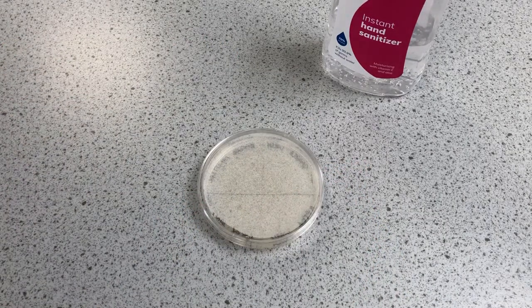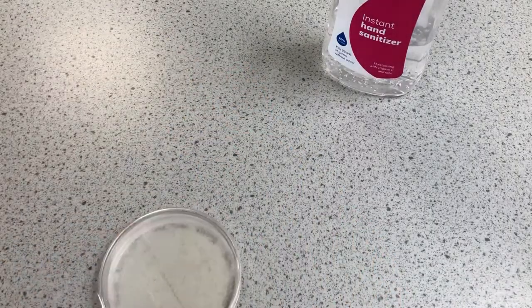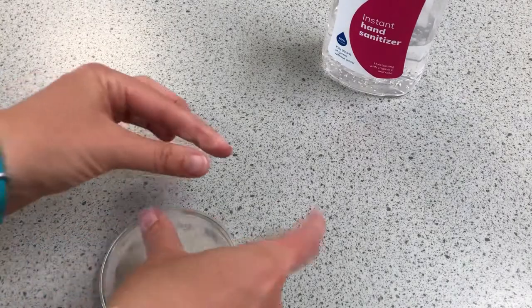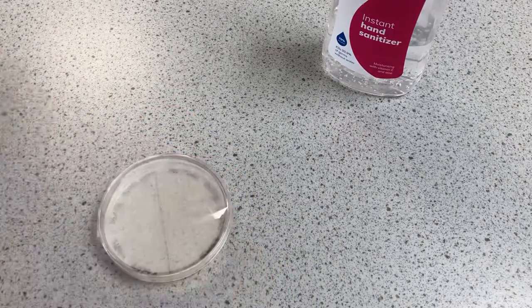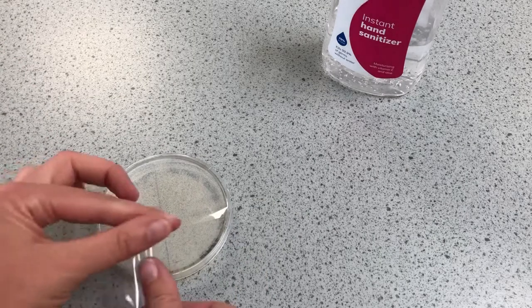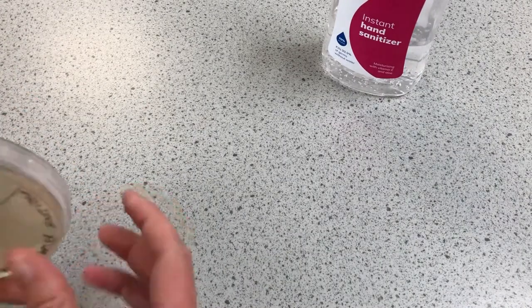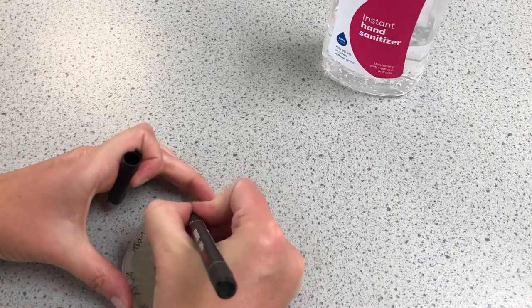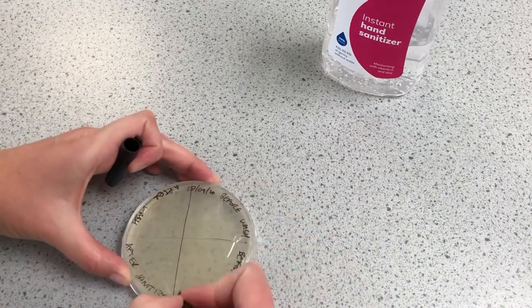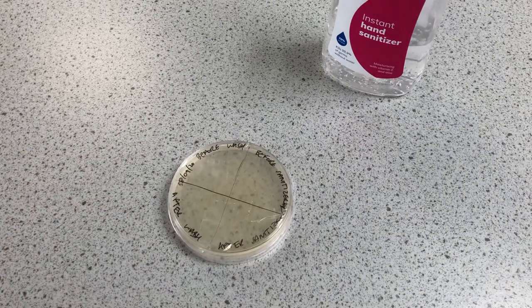I'm going to seal it with tape and date it as well, and then we'll come back and see: is it better to wash your hands or is it better to use sanitizer? Creating aerobic conditions — oxygen allowed in — and I'm just going to pop the date on there and my initials. We'll see what that brings.